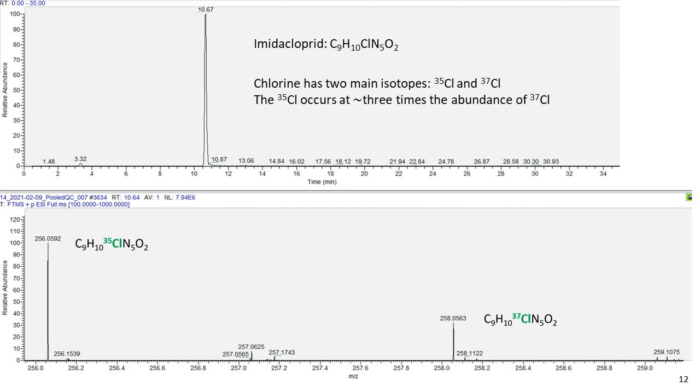And this is very useful because the ratio of these 2 peaks is actually a constant, and the software is able to tease out basically all the compounds that have, for example, chlorine in them, which is an extremely helpful aspect when we look into chlorination byproducts. So byproducts that are forming when we use bleach, for example, in the disinfection of surfaces, or it is also very commonly used in drinking water treatment.